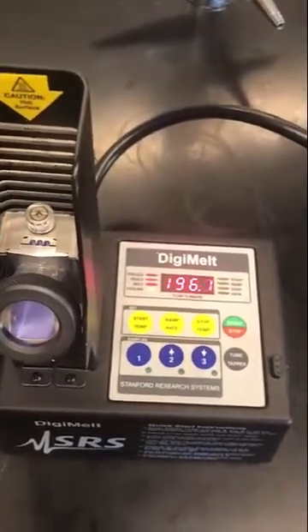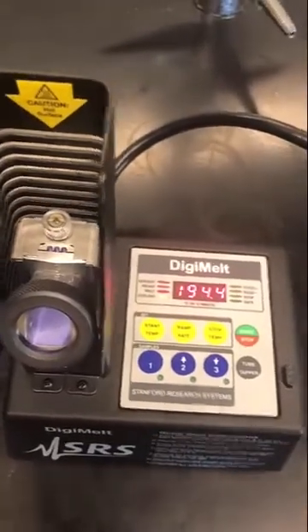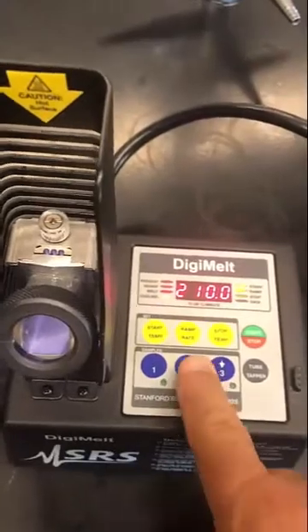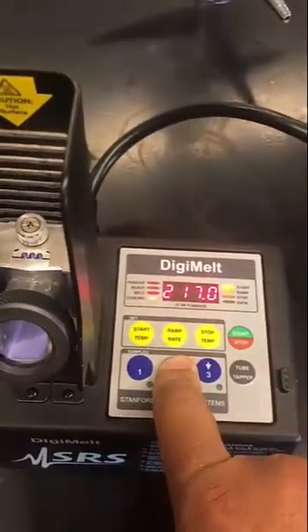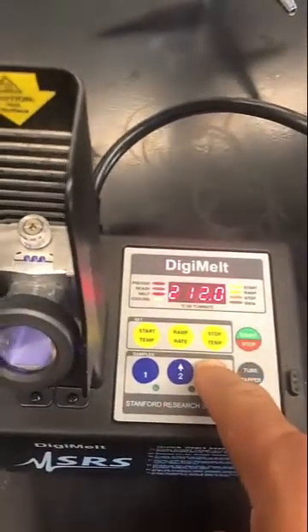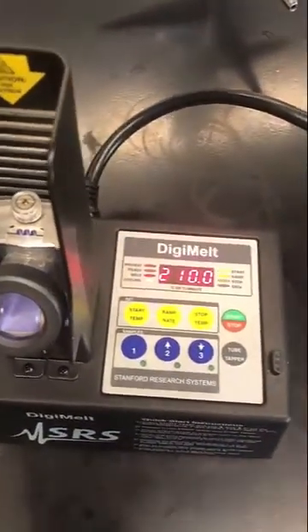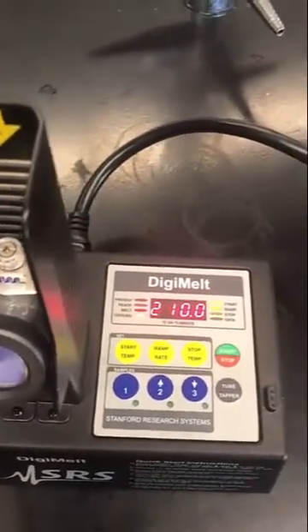In order to do a melting point, you have to have basically two pieces of information programmed into the DigiMelt. One is the start temperature, and I set this start temperature to 210. If you push this button and hold it, eventually it'll start going by fives, or you can push it to get it down. So let's pretend we have something that's going to melt around 220 — typically you start about 10 degrees below.